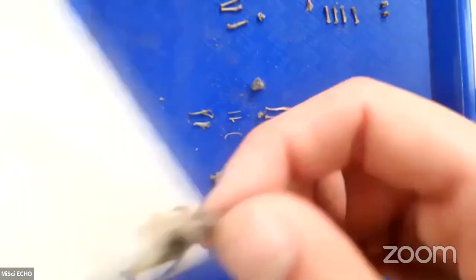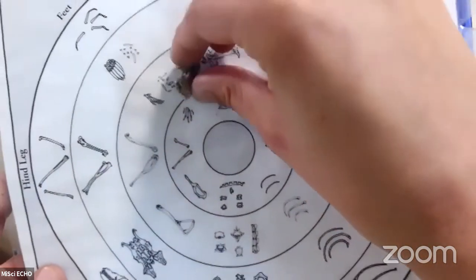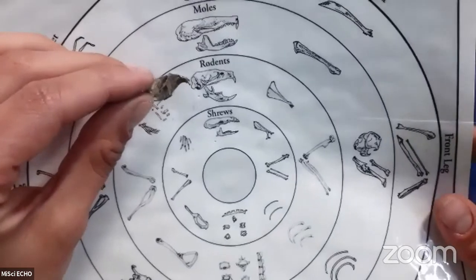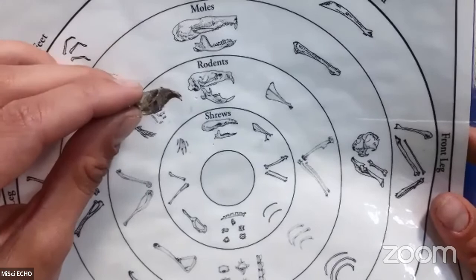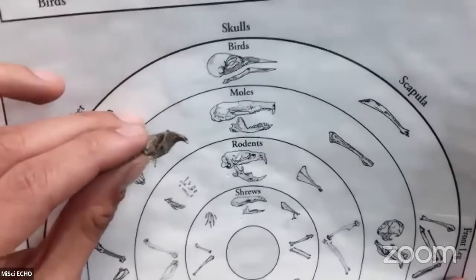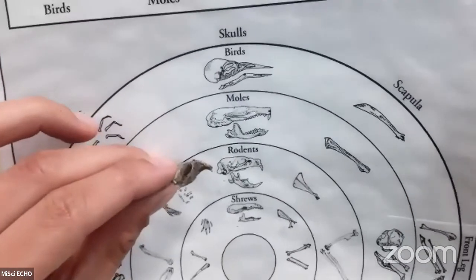So let's take a look at our dissection guide here. Let's see, do we think that this upper skull piece, which might be easier if I keep it turned sideways, looks like the top skull piece from our rodent? Tell me if you agree or not. Or do you think it might look like one of our other organisms listed on this chart? All right, some people are starting to agree, especially if I keep them near each other.